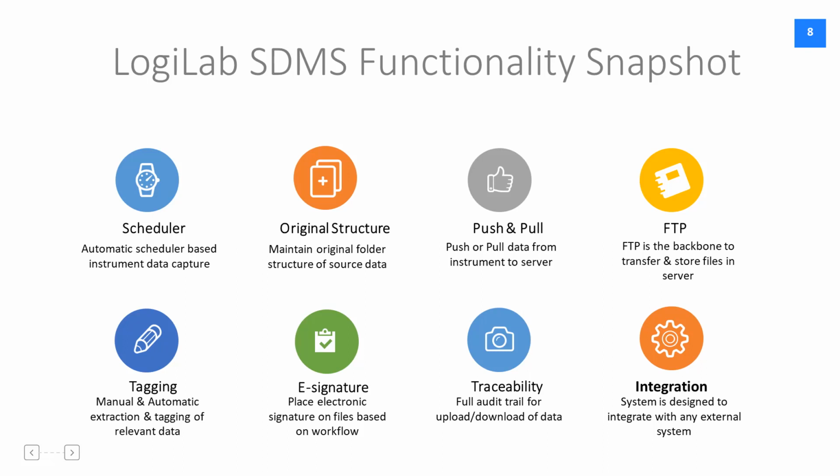Logilab SDMS has full traceability. It has a built-in audit trail for recording uploading of data, downloading of data, restoring of data. All of these activities are 100% audit trailed with date and timestamp, along with who did what and when and why. The audit trail contains events with respect to upload of data, download of data.